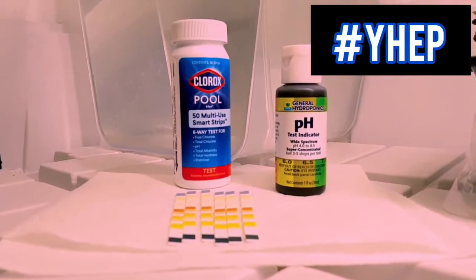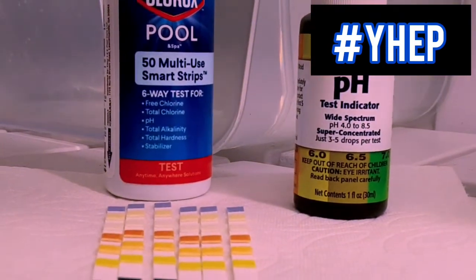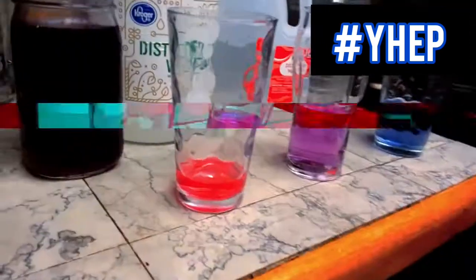We're going to make a simple testing solution that we can use to test the pH of our water for the purposes of monitoring plant health. If you have ever used or seen someone else use testing strips or a pH kit to test the levels in your pool, we're basically making a simple version of that in the form of a solution — or, if you're feeling creative, actual test strips.